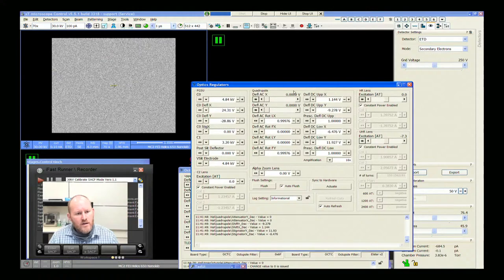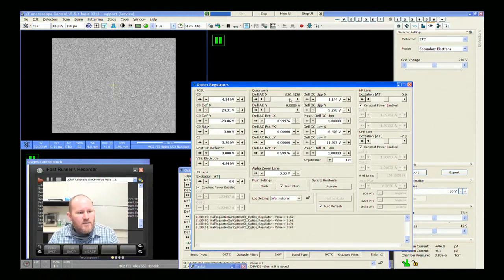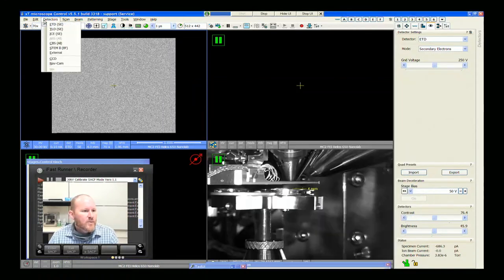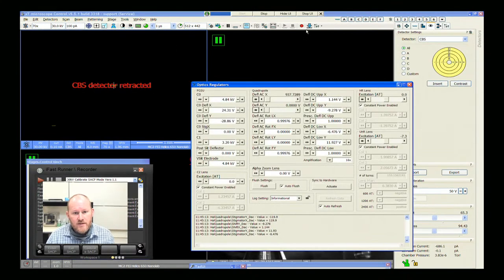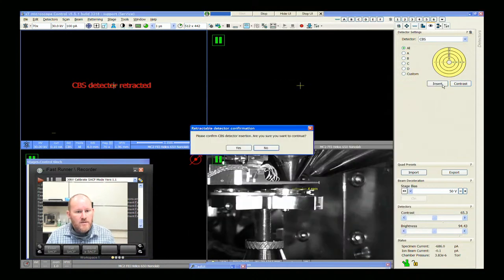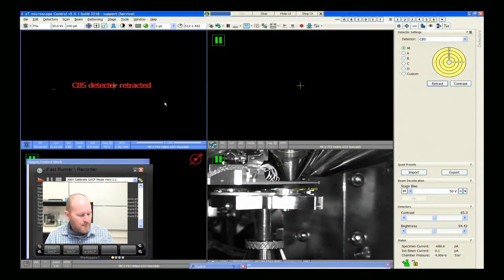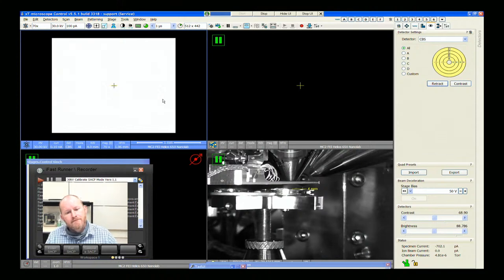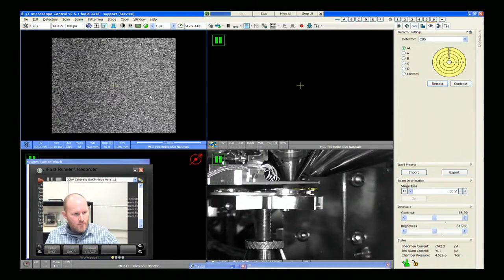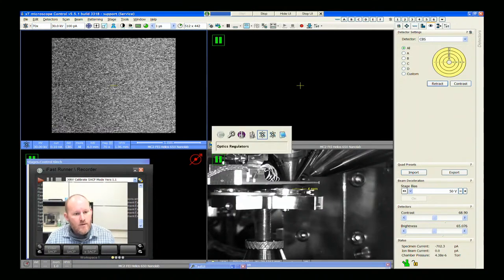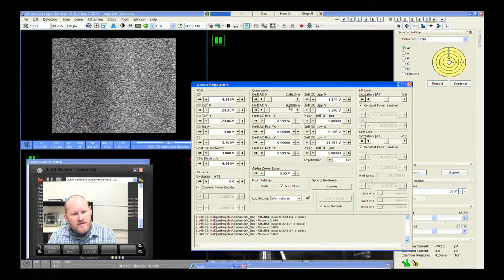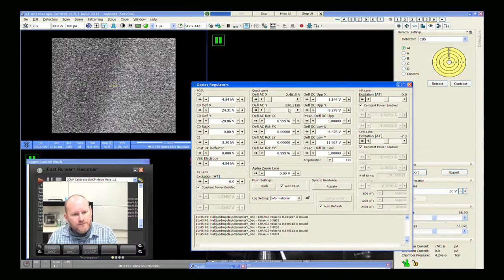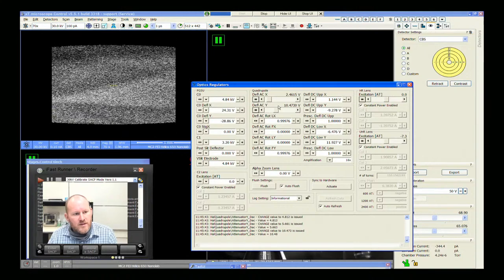If I bring the quadrupole values up and go back to CBS mode so we can start to see the pattern show up — insert the detector. Now if I increase these AC values, something like 15 — there, okay. So we can see this needs to be a little bit bigger.